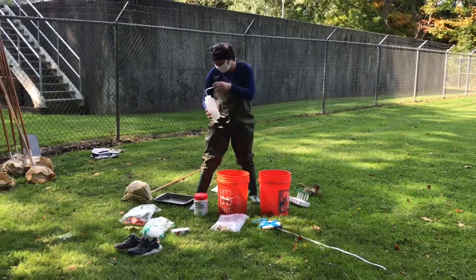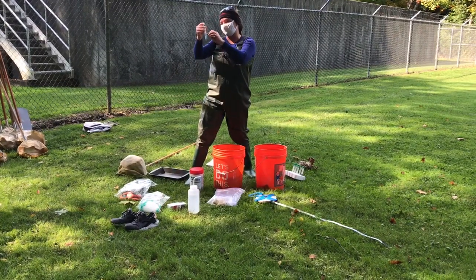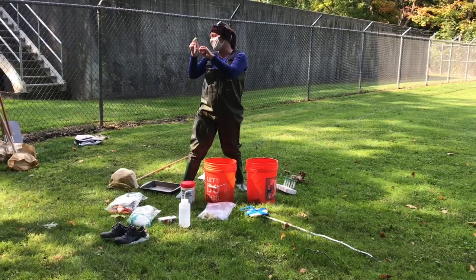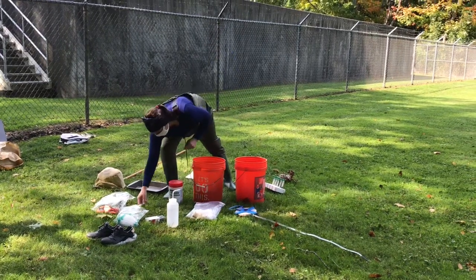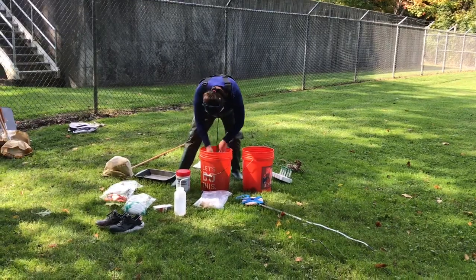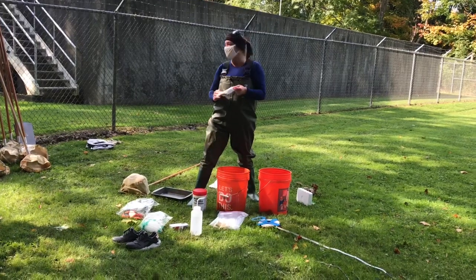So, you'll want to fill up your vial with a little bit of ethanol. I would say, probably up to the bottom of this white square is enough. If you need a second vial, feel free to get it. That's going to be just fine. So you'll mark the outside with Sharpie. What I also have are some... Someone have a question? I heard some.